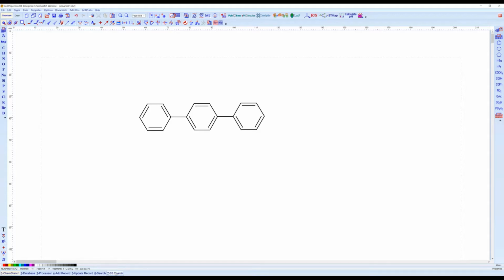And if I click it here, it's a bit maybe small, but it's down here. I click substructure search, and it's going to go into the Spectrus DB interface again, do a quick search, and tells me that there are 4 hits found. The moment I click OK, it's going to show me these 4 hits. It shows, for example, this molecule here, and the substructure that I had selected is highlighted in blue. I can continue here, and again, this is highlighted and so on.